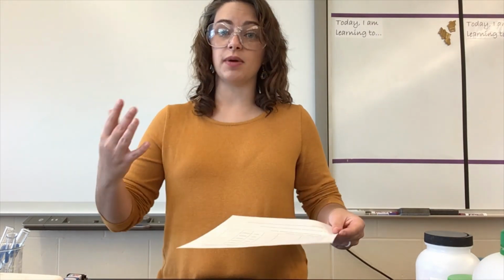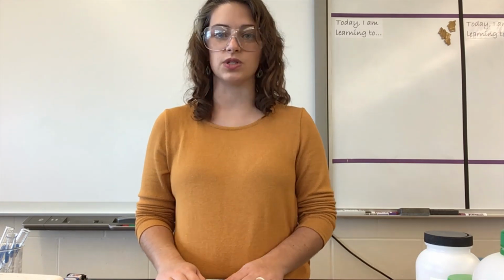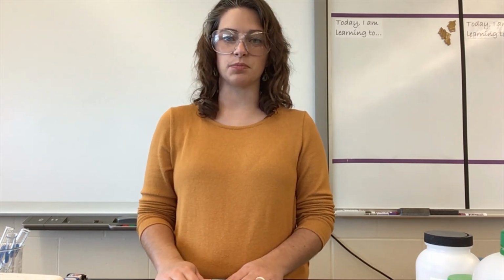And so from there, you should be able to answer the rest of your questions for your lab conclusions and results. And there you have it. That's our exploration of the different types of compounds and their properties.